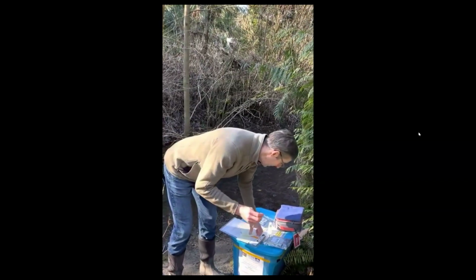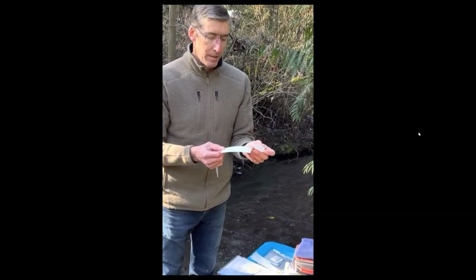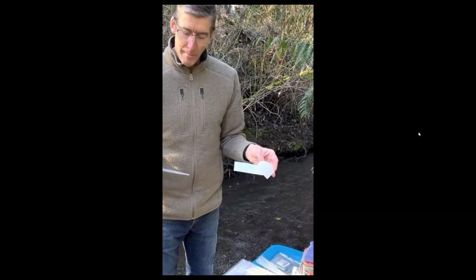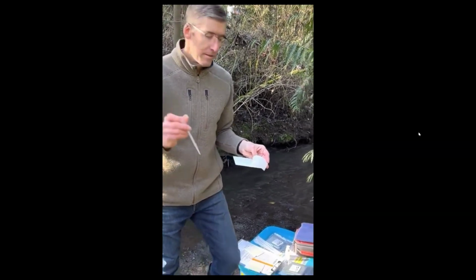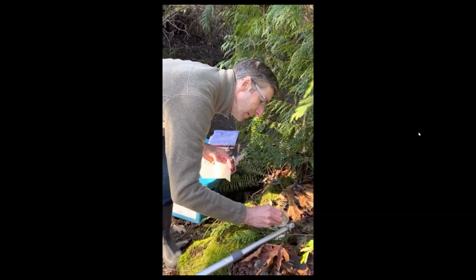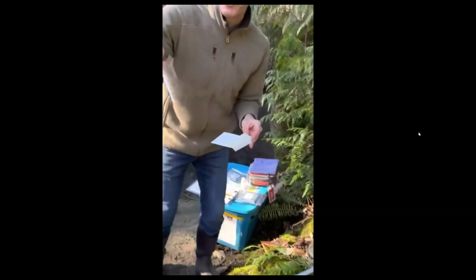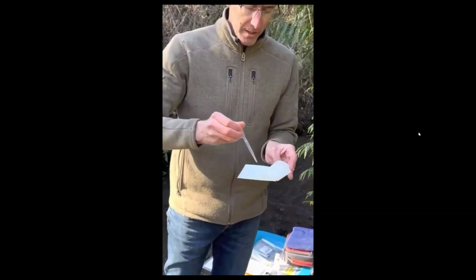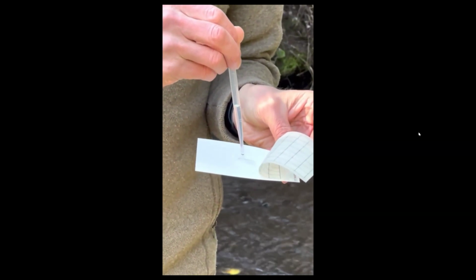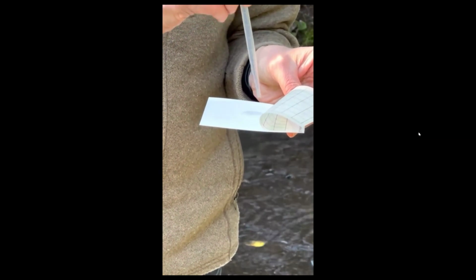So I've got my clean pipette, and then I'm gonna take my R card and I'm gonna carefully open it up and just hold the flap back. And now I'm gonna collect a 2 milliliter sample. I could do up to a 3 milliliter sample, and I'm just pipetting directly out of this sample jar here. So I've got a 2 milliliter sample, and I'm just gonna place this on the center of the card and keep it centered. And that's the trick with this technique, is keeping your sample centered.